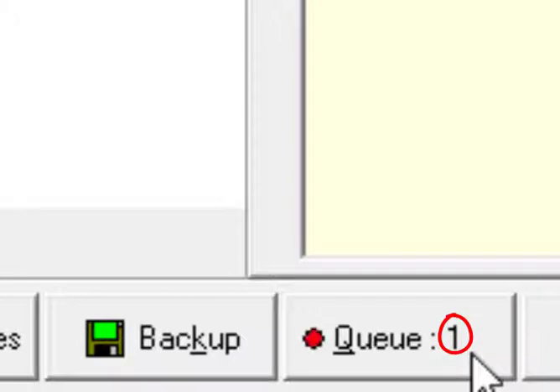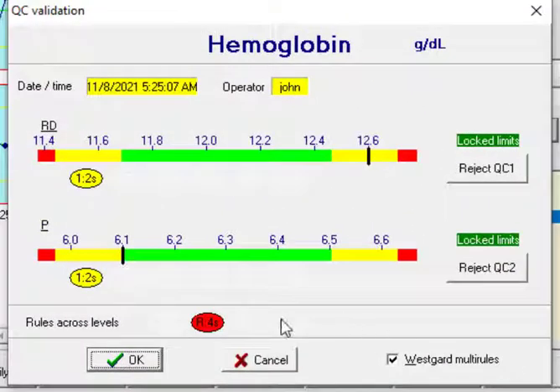This is the one that I did not confirm because a rule has been violated. When we use two levels of control, we have to interpret them together with each other, and you are not allowed to interpret them as a single level.